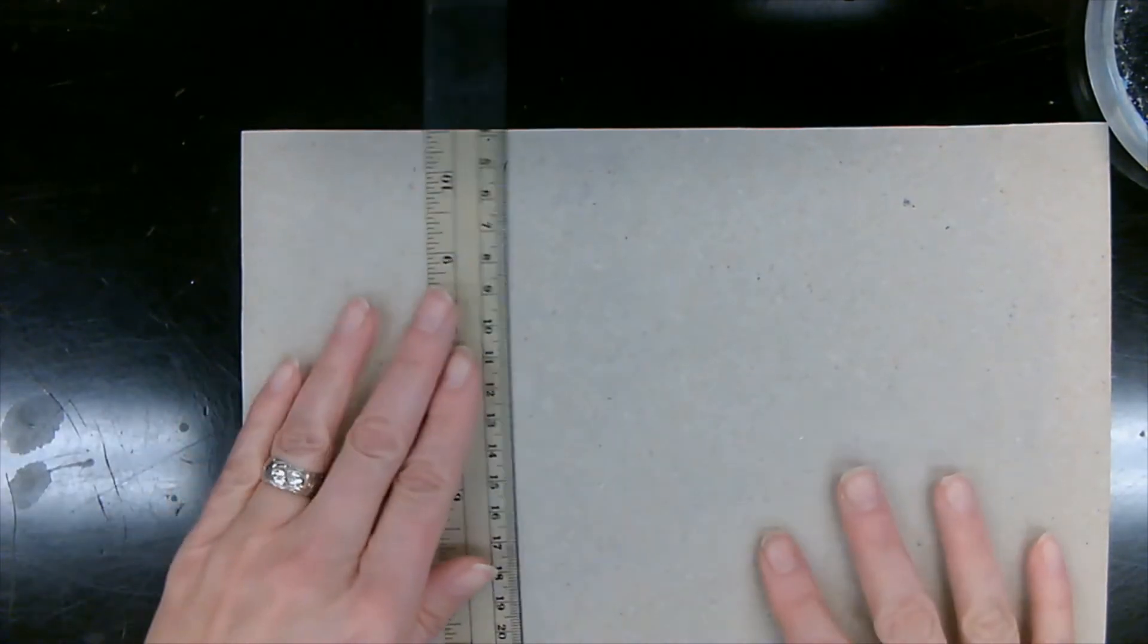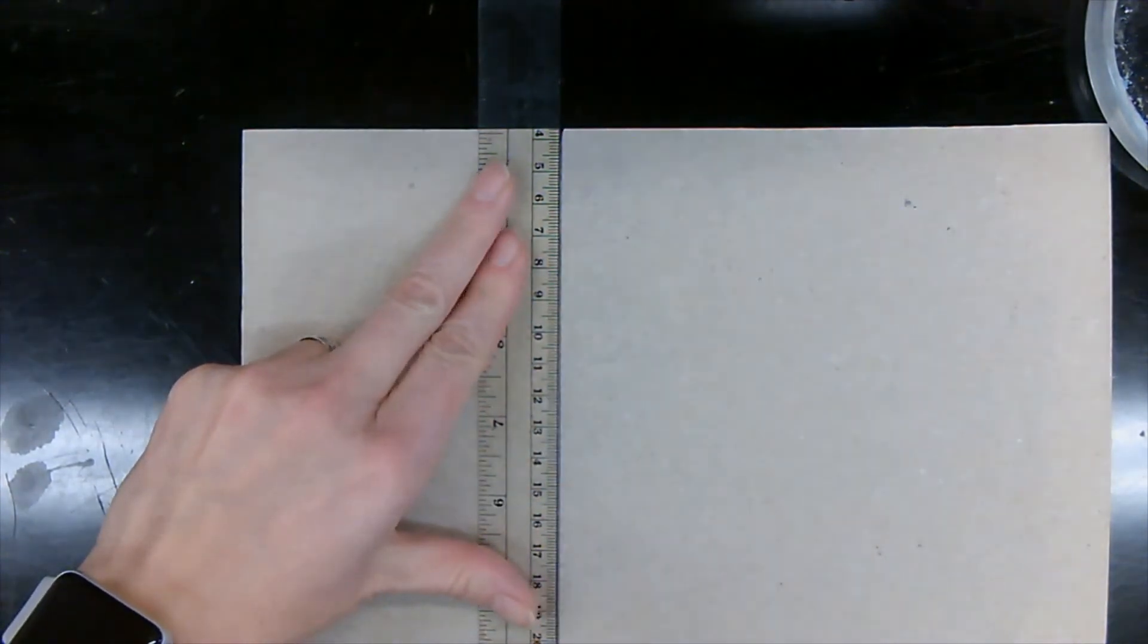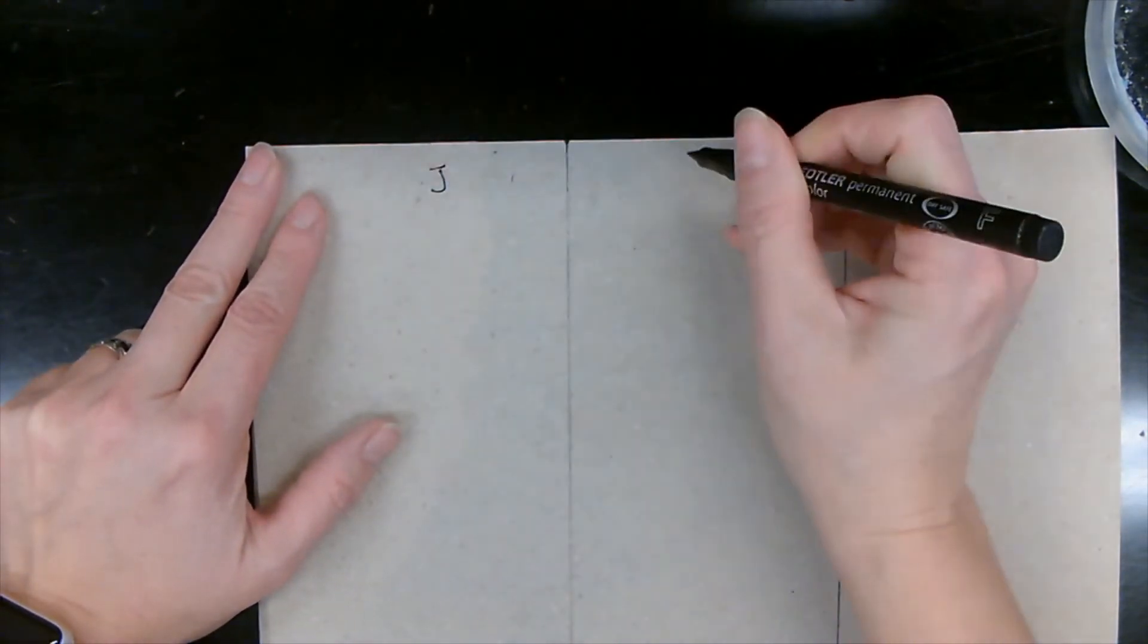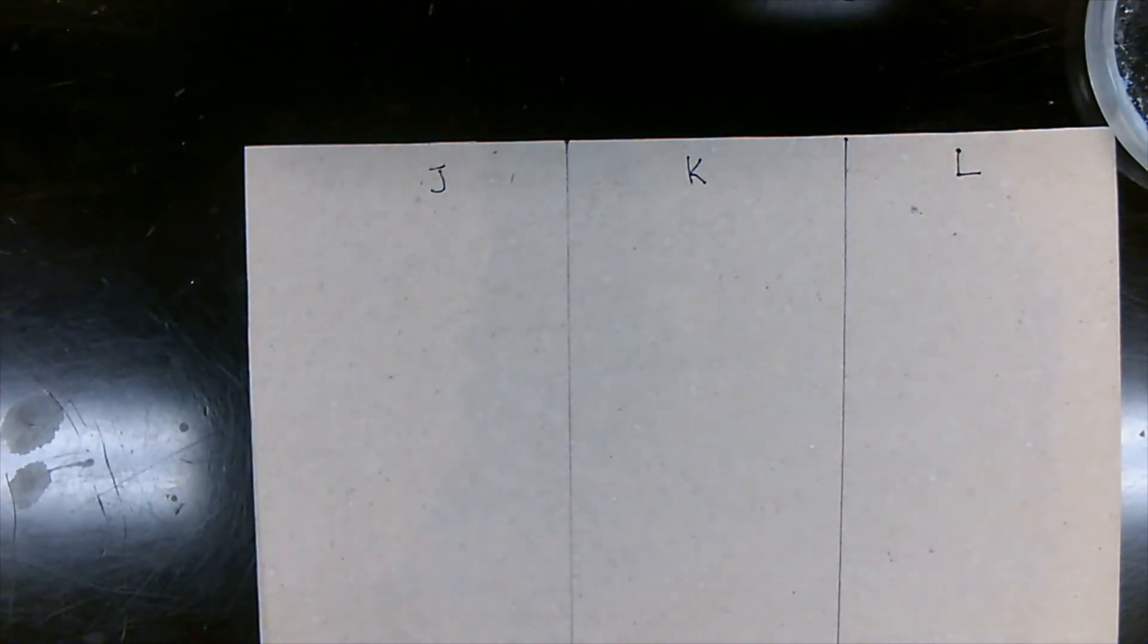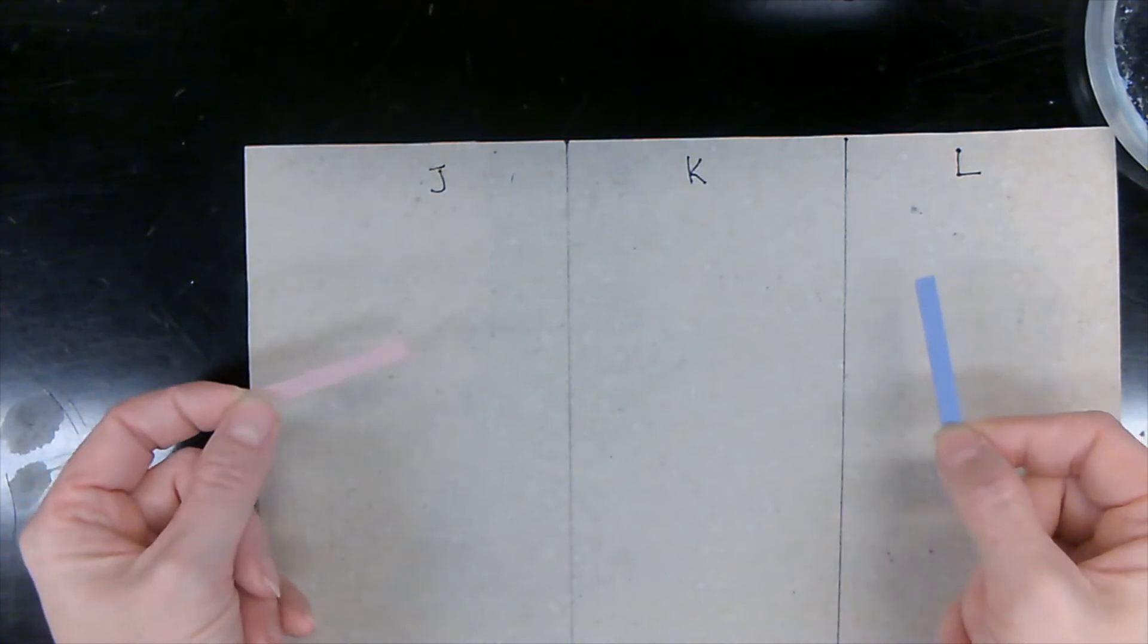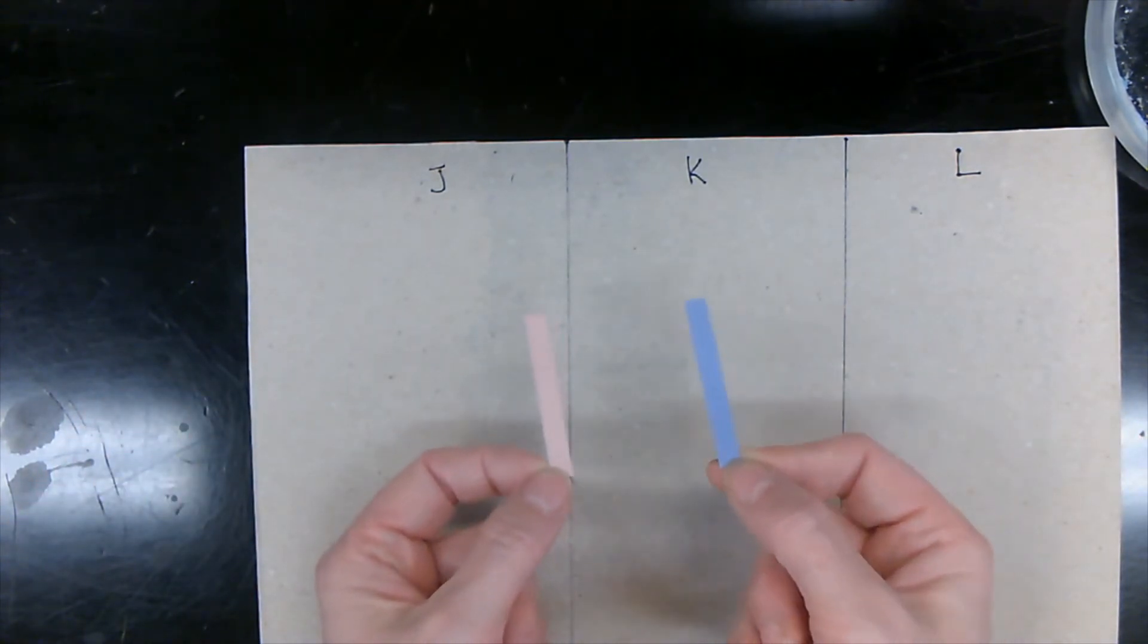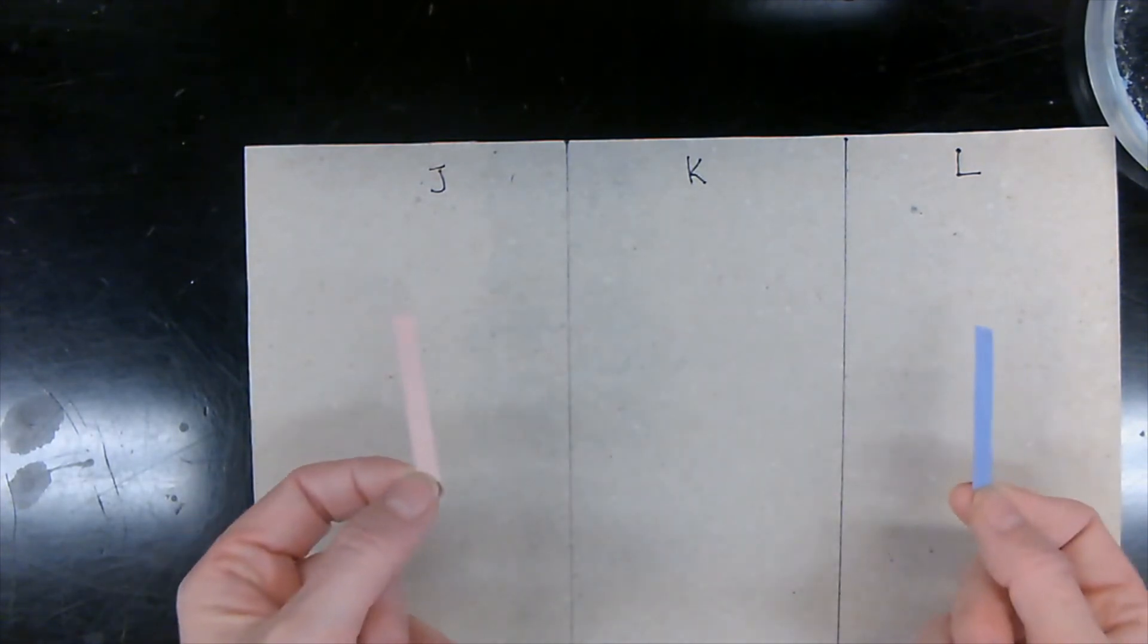So now let's do our litmus paper testing. We're going to divide this paper up into three. Litmus paper, red litmus paper, blue litmus paper. Again, litmus paper helps us identify if our salt is going to be an acid, a base, or neutral, and we need both of these papers. So let's cut them up and put them here.